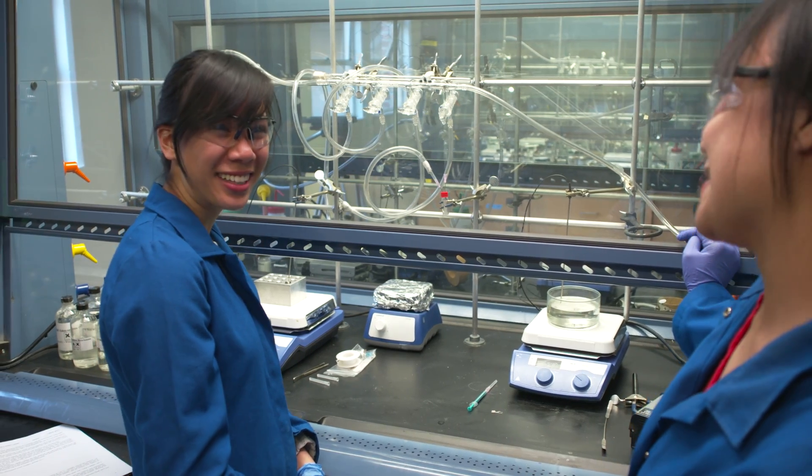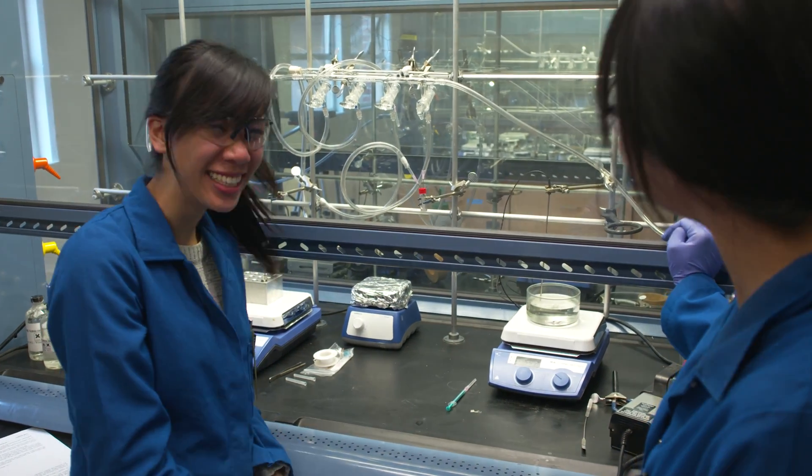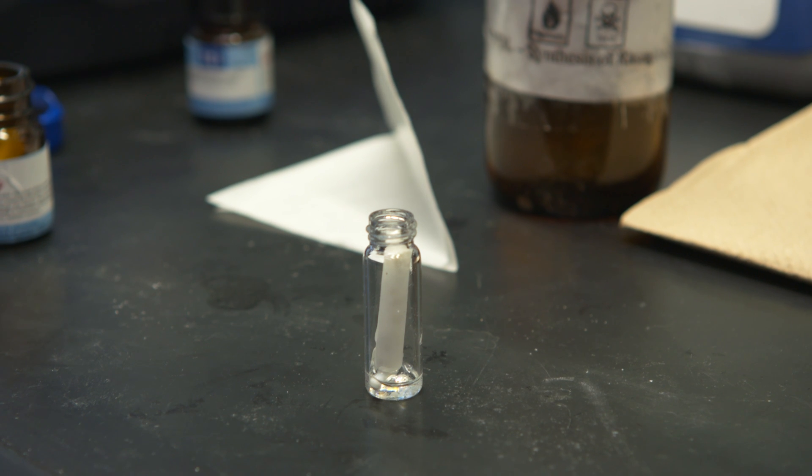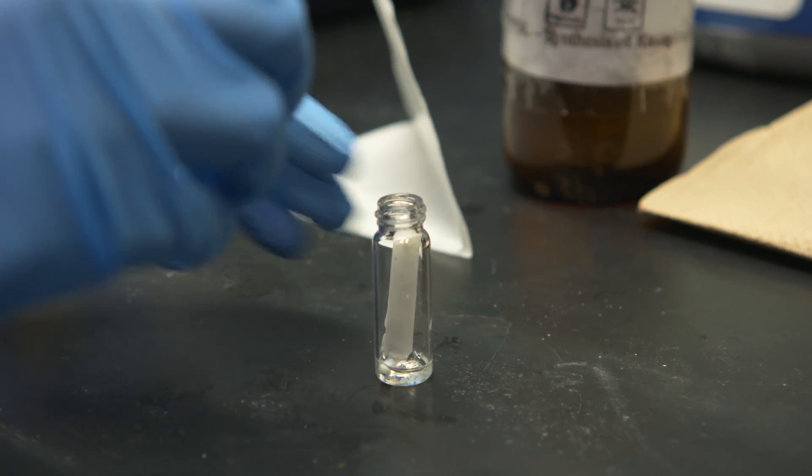Organic chemistry has been taught the same way for decades. What you've seen today is we can get students excited about organic chemistry by having them carry out modern research-related experiments and in this case all enabled by new chemical technologies.